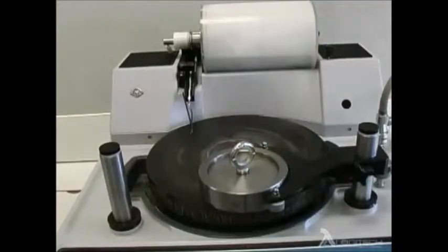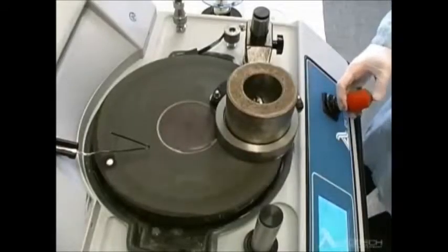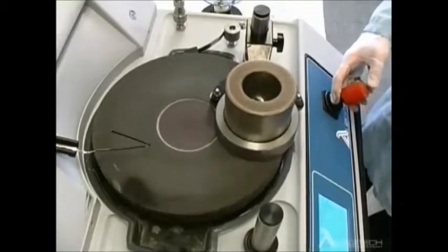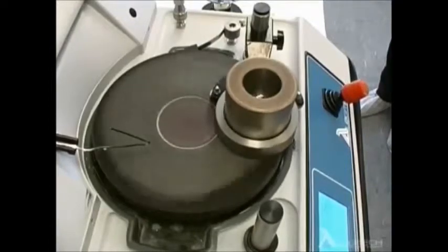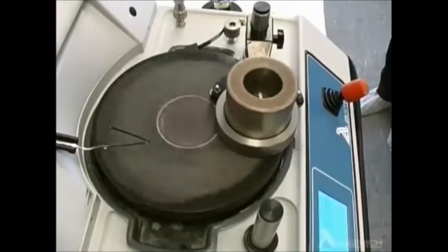The first step in using the PM5 system is to ensure the processing plate is the correct shape prior to lapping. This is done by placing a weight on top of a grooved test block and running it for a short duration prior to processing. This allows for materials being processed to be shaped convex, concave, or flat depending on the customer requirements.